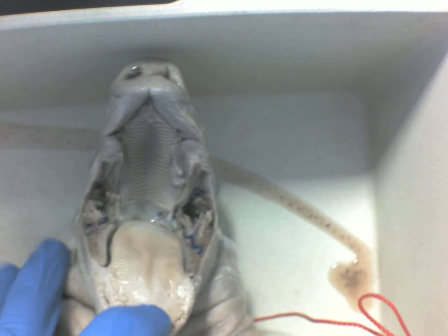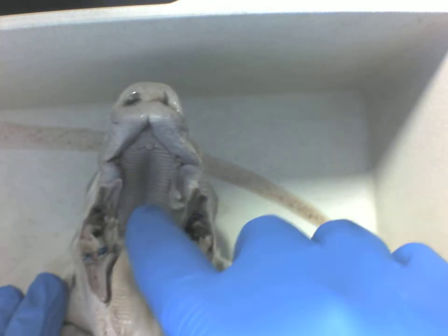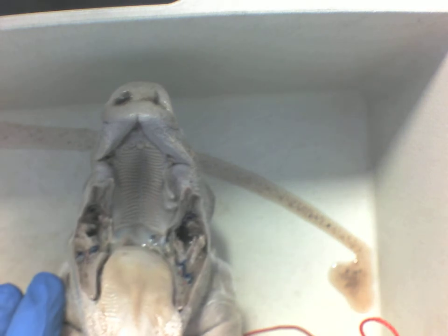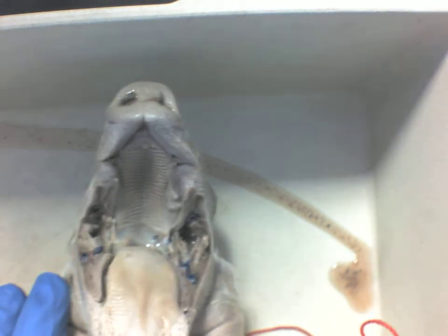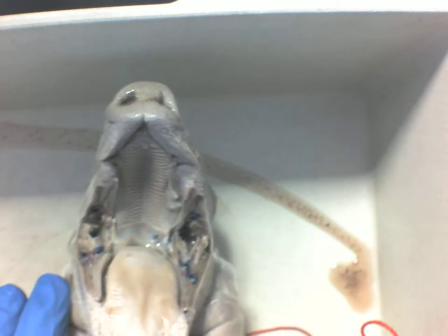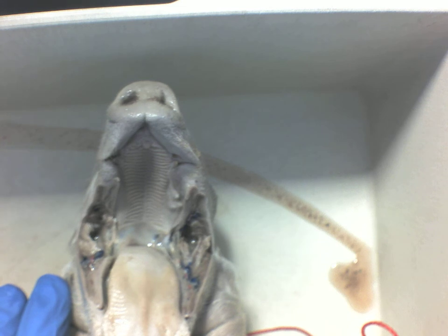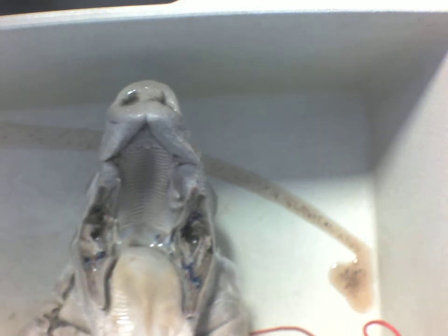The top of the mouth, you might notice, has got some ridges on it. If you can't see, you can look up at the board. You have it too. If you take your tongue and rub it across the top of the mouth, feel those ridges. What do you call this part of your mouth? The palate. Very good.